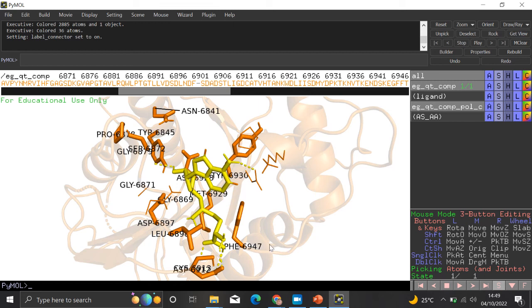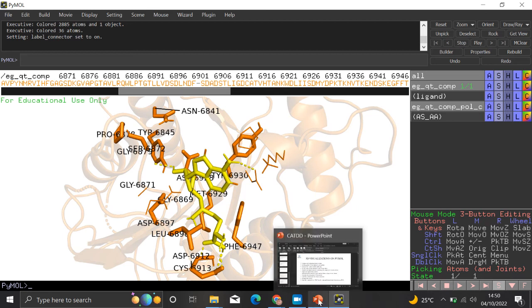Also, for this one that they look squeezed together, we can separate them. You just double click and hold your control button and you drag it to a place not too far away from the residue it's interacting with. So we are just going to do this arrangement on and on and on till we get an orientation that we consider perfect, that is suitable for us. So we just arrange till we get something that we are comfortable with.